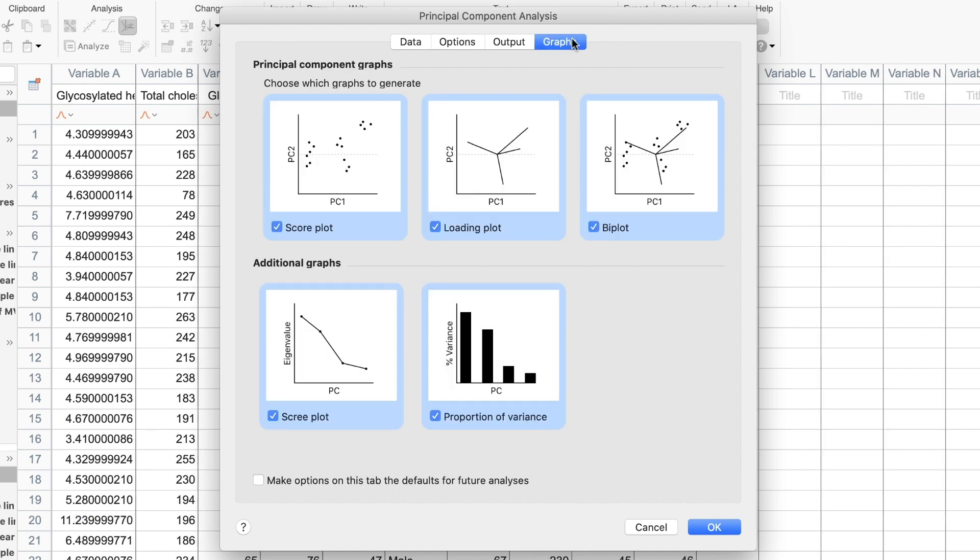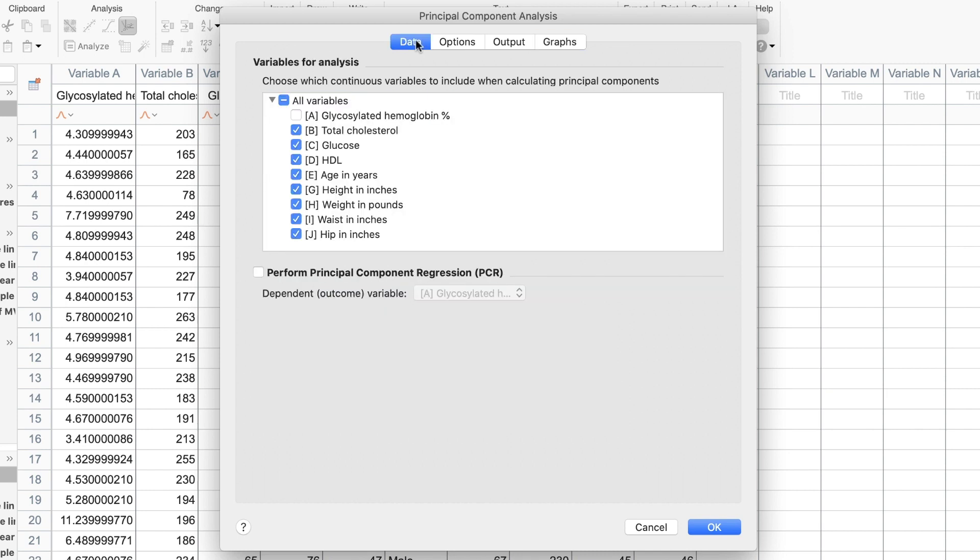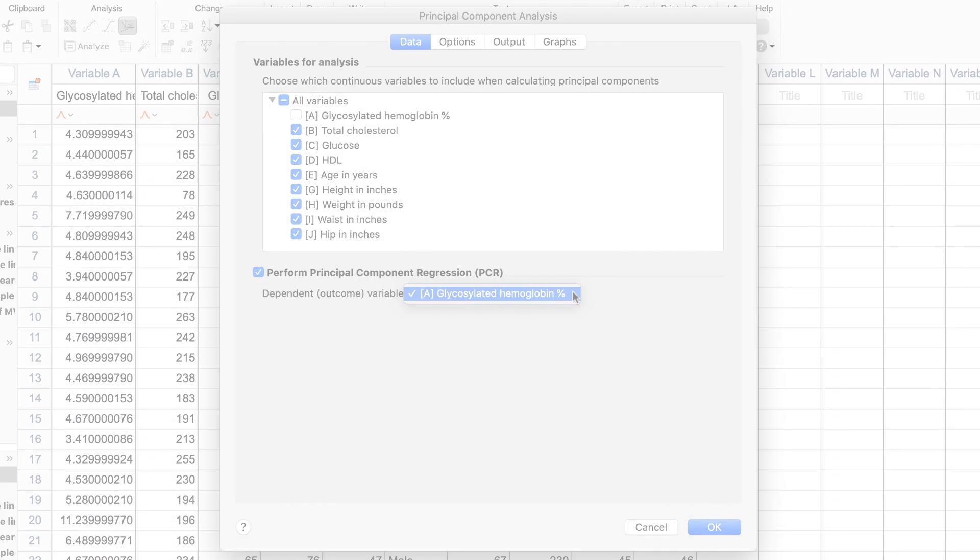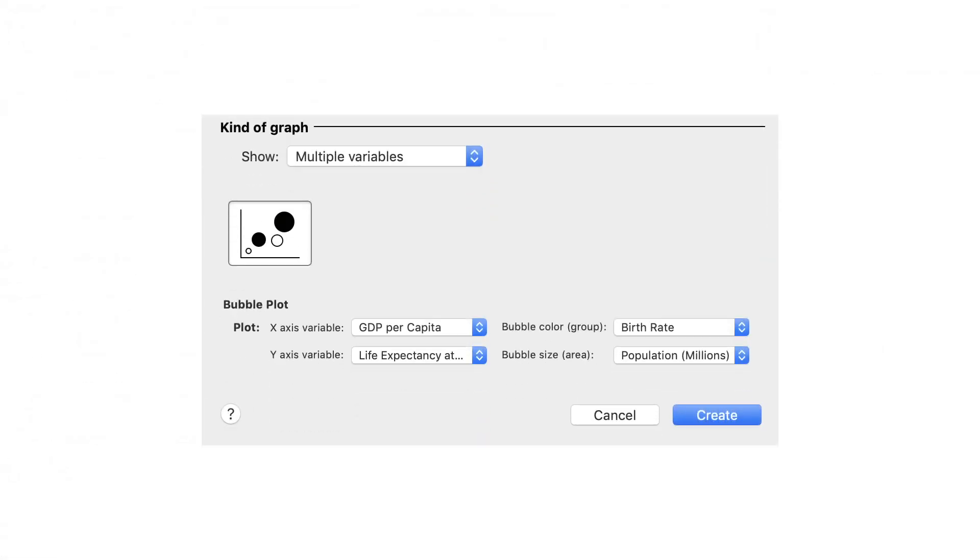Five PCA graphs are also available to help interpret your results, as well as automatic preparation of PCA results for further use in multiple linear regression. The multiple variables data table also has a new graph type, the bubble plot, which utilizes the new categorical feature now available in these data tables. This is the first of many new multiple variables graphs planned for version 9.